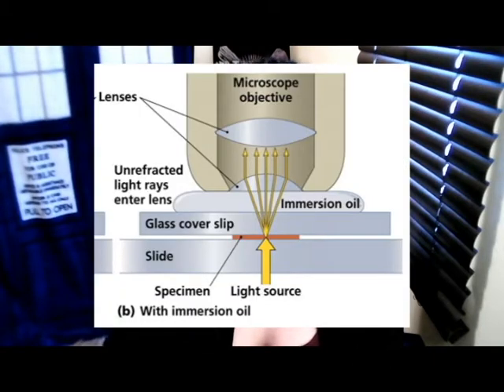But if you change from one objective to another and it remains in focus, that's parfocal. The difference between the two could either be a fill-in-the-blank question or a multiple choice question.